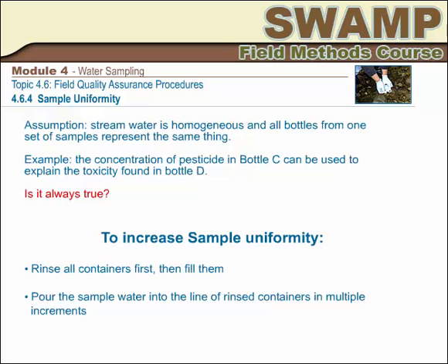Note that the same incremental transfer principle is also applied when you are splitting a sample to create aliquots or subsamples. And check out Common Element C, section C.2.3 for more information.